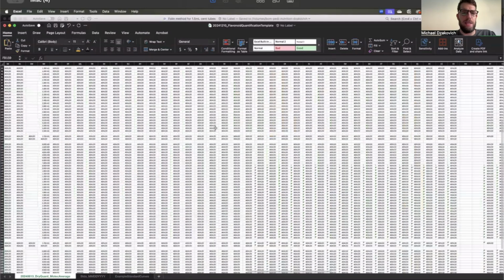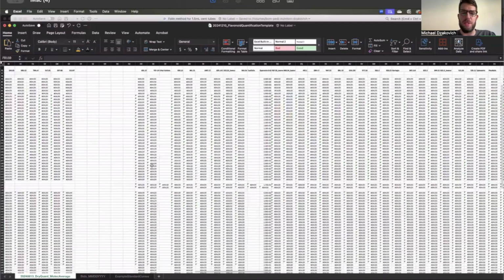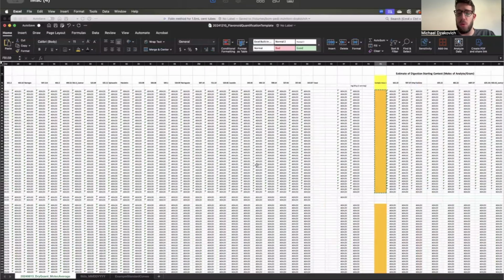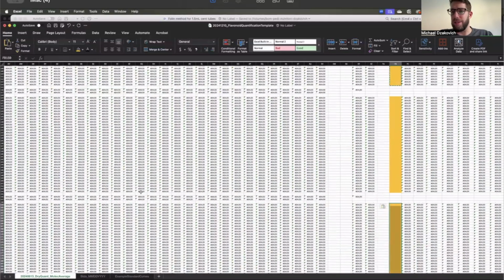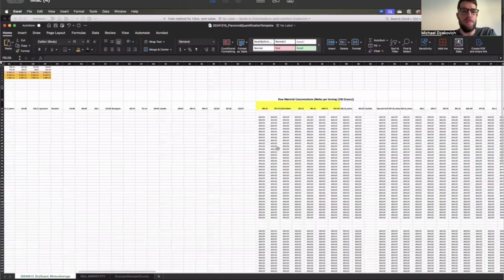The only other thing that I added in here is a little bonus. Sometimes it's nice to look at the contribution of an individual flavonoid versus the total. You can see there are a couple rows between some of these chunks of future data that will take an average amount and divide it out of the total over here. So you can see, oh, this flavonoid is like 20% of all the flavonoids in our samples or something like that. Just another metric you can use to interrogate your data a little bit.